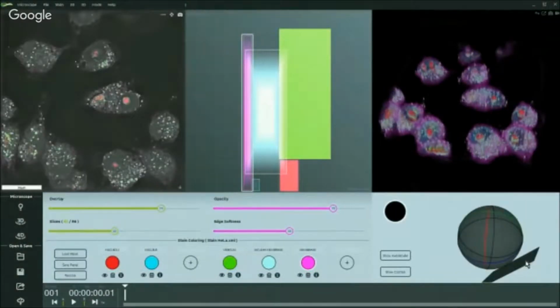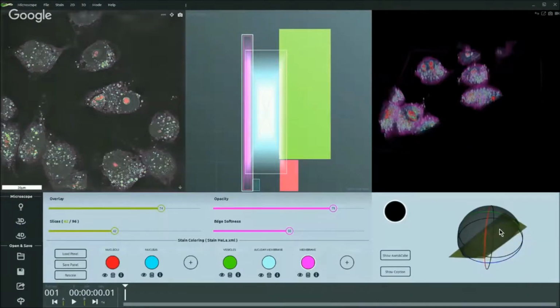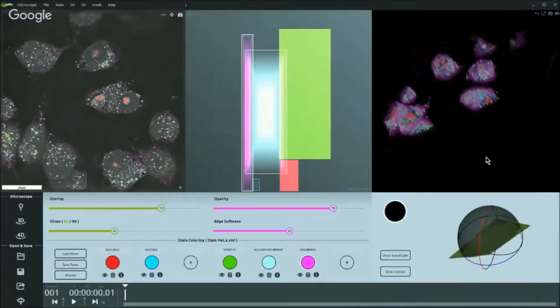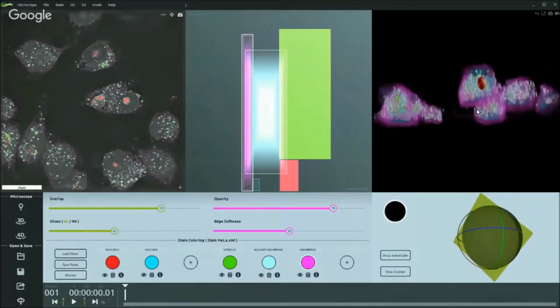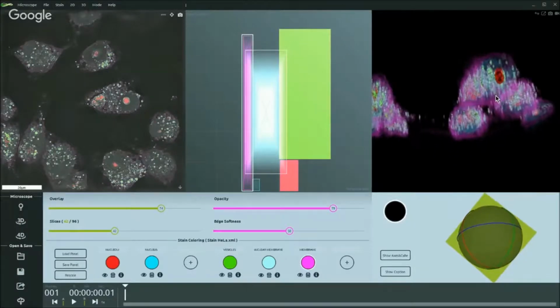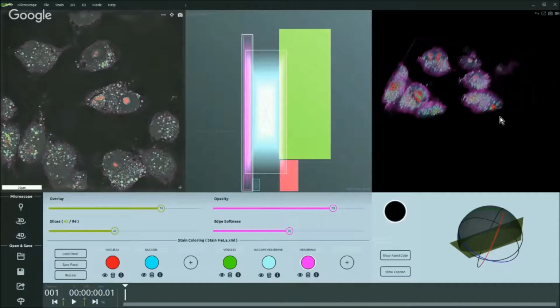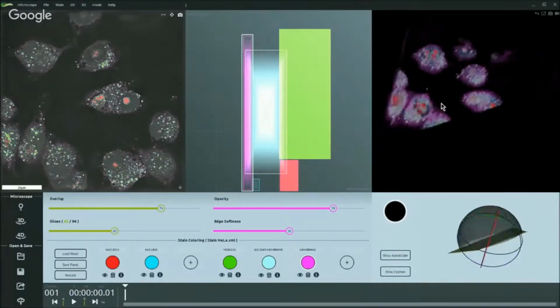So you can go down here, select this cutting plane, hold shift, and enter into your image. Okay, so let's place ourselves here. And boom. What we obtain here is a cross section of your cell. You can really see different layers outside, nucleus, vesicle, nucleolus, ER, and so on. So this is a really, really powerful instrument and very easy to use.